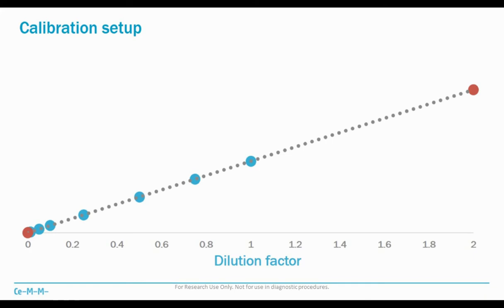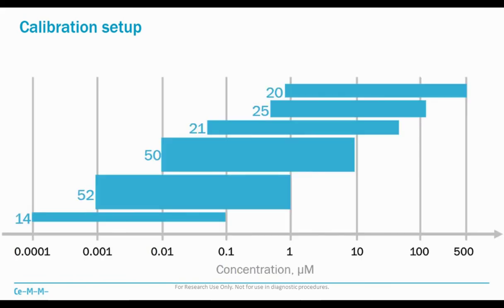So, this is how it looks then, without log scale. We really try to be quite equidistant with our calibration curve so that it nicely sits in the middle of our samples. And all the compounds were grouped in 6 groups based on calibration concentration. The majority of them were from 10 to 0.01 micromolar.